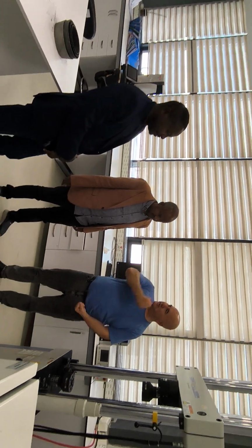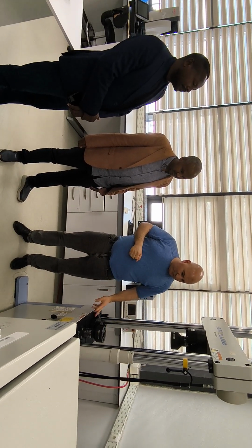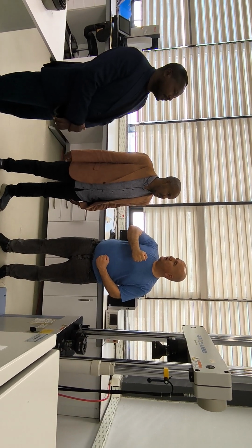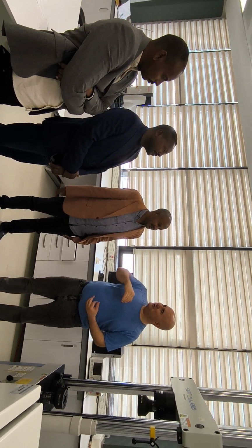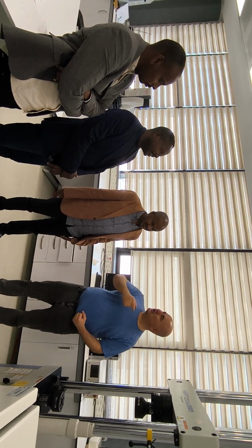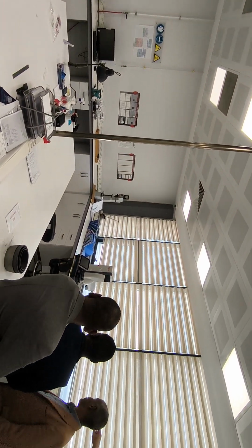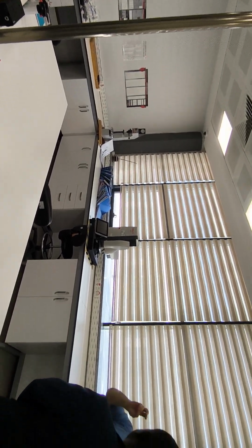So we can compress and apply tensile stress, and we can also control the frequency. We can go up to 50 hertz, but if the loading is too high, we decrease to 1-2 hertz. This one is for hardness testing. This one is for Vickers, Brinell, Vickers HV, hardness Vickers, hardness Brinell, and Rockwell.